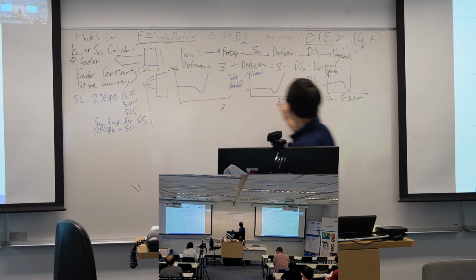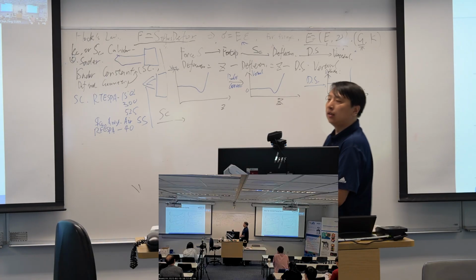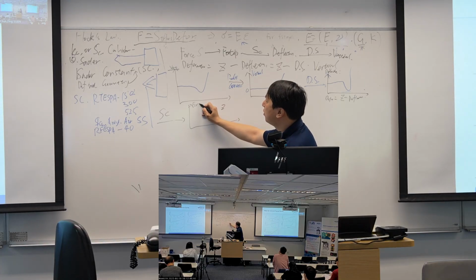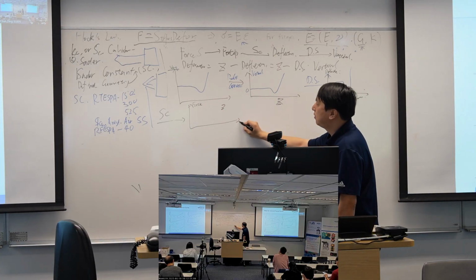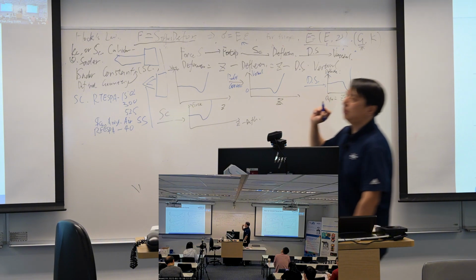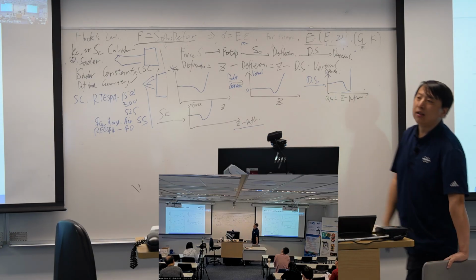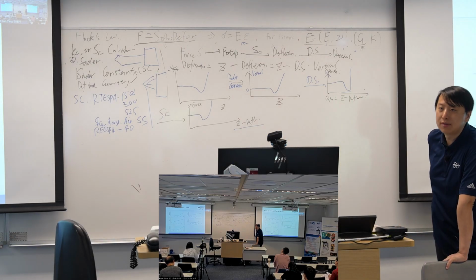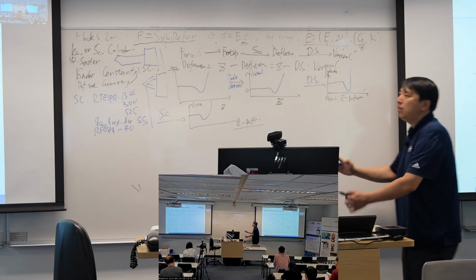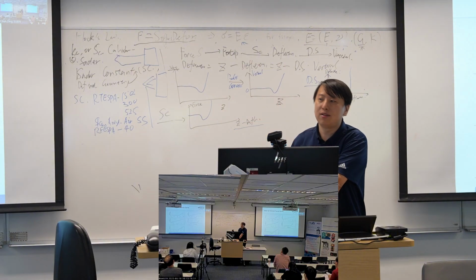After that, you can apply the spring constant, so the y-axis can be changed to force, and the x-axis is Z minus deflection. So our final curve will be something like this. After that, we cannot change Z minus deflection to deformation yet, because it requires us to tell the software the 0 point, from which Z minus deflection means you are compressing the sample.